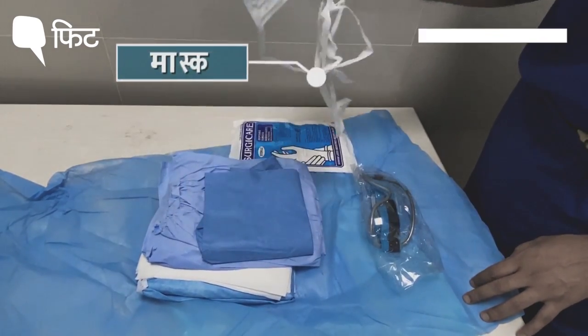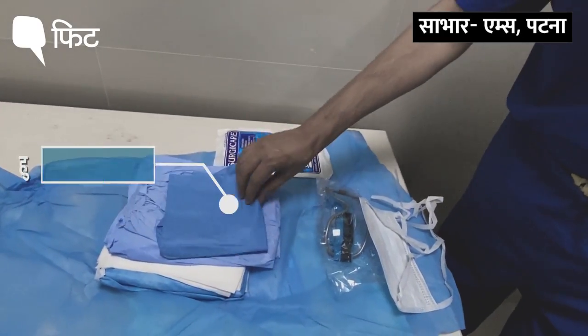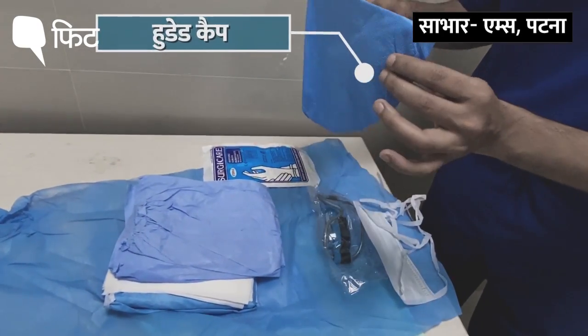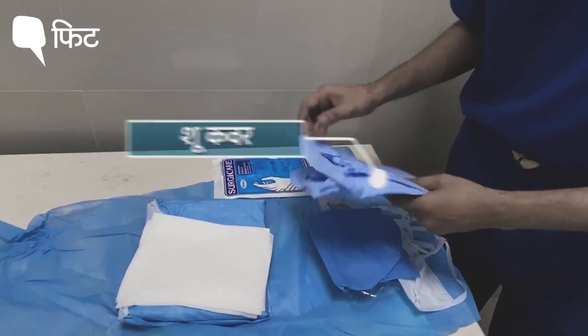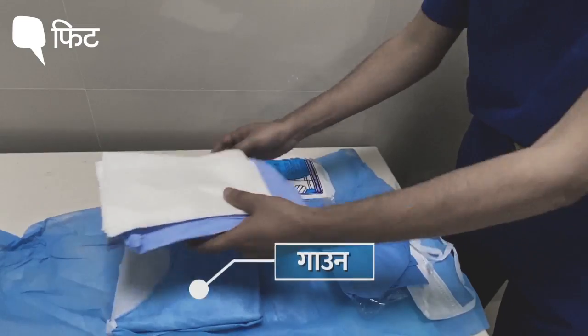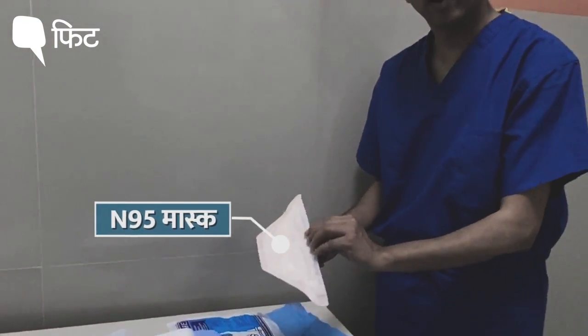Goggles, a mask, a pair of gloves, this cap which is a hooded cap, a pair of shoe covers, then towel and the gown. An N95 mask that is being supplied by the hospital.